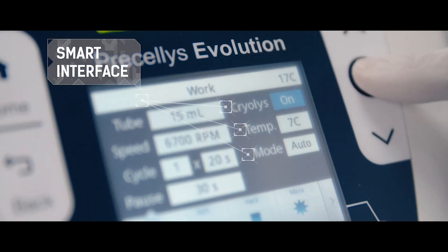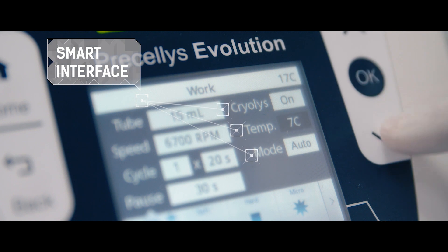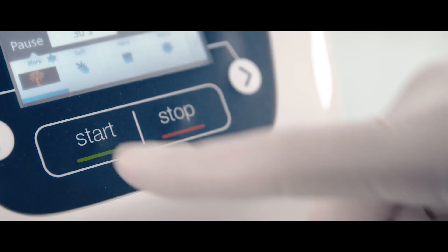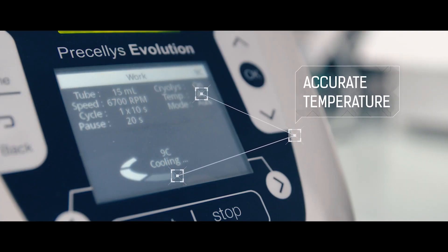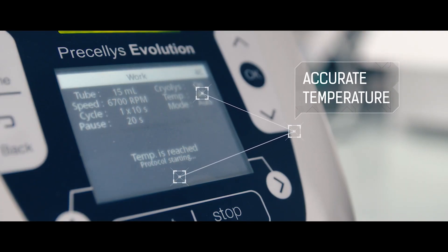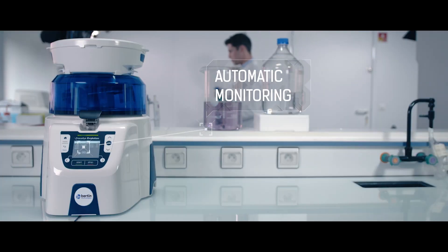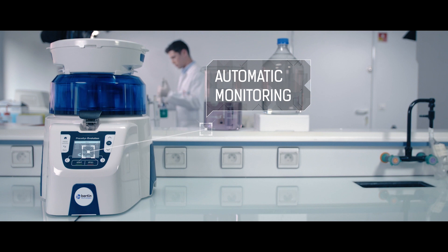The Pressilis Evolution software monitors the temperature for fully accurate results. Thanks to the automated cooling mode, the homogenization starts when the set temperature is reached. It stays consistent during and after processing to keep your samples in optimal conditions.